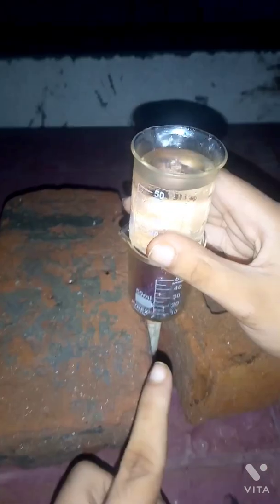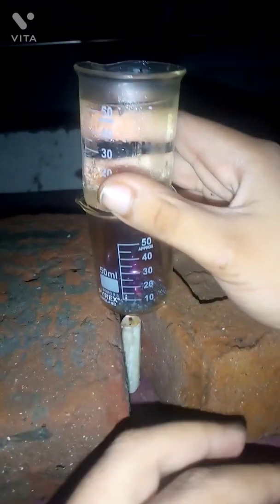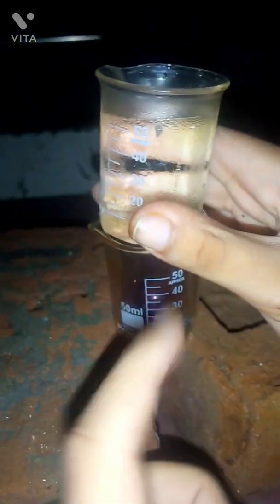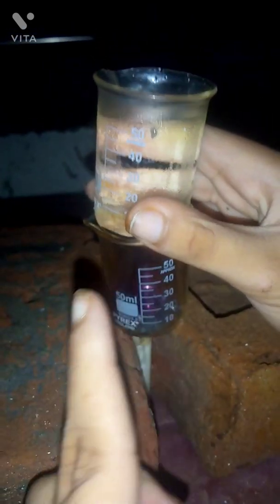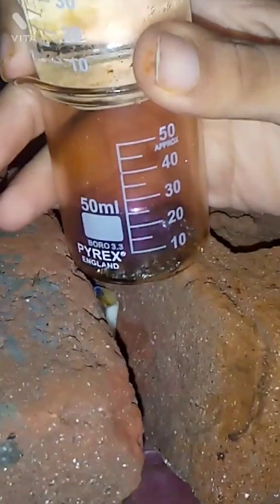And now take the other beaker and place it carefully into this beaker. You may see from the sides the purple fumes coming because the iodine is melting, and it will evaporate, collide with the top beaker and recondense. With that, the crystals form by sublimation of the iodine.